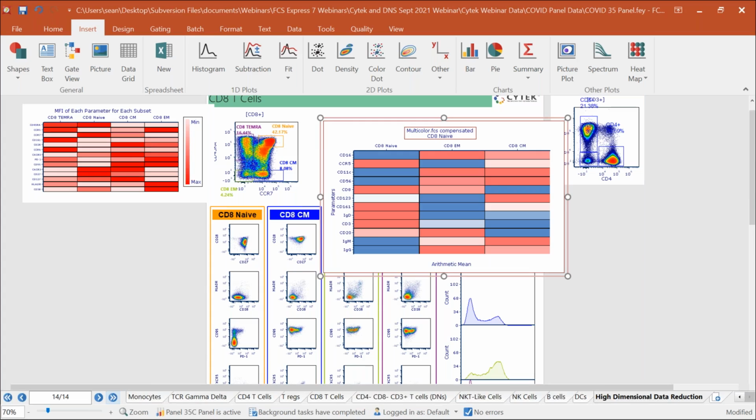So what I'm going to pull up here in just a moment is some uMAP charts, all right? And we're going to be visualizing some of this data in uMAP. We're going to be visualizing some of this data in FlowSOM charts. And what you're going to see in FCS Express is that when we work with these tools within the software, they're all natively implemented. Now, what does that mean to be natively implemented? That means that the software tools are going to be running on your local computer, utilizing the RAM and processors and resources that you have. It means that we're not going to rely on R. Right, so very importantly, you're not going to have to be an R scripter.